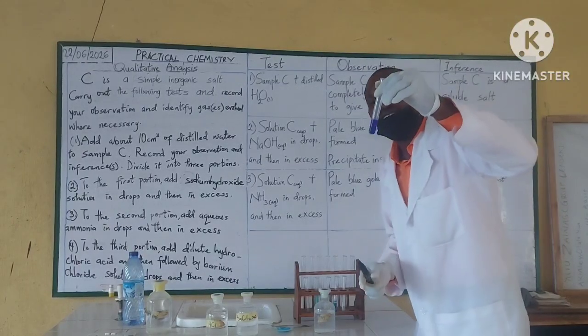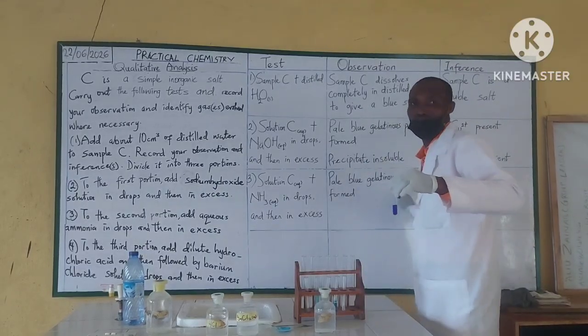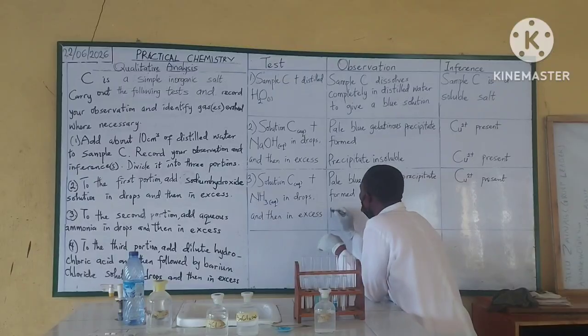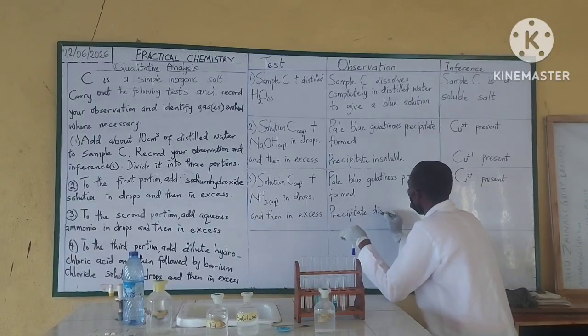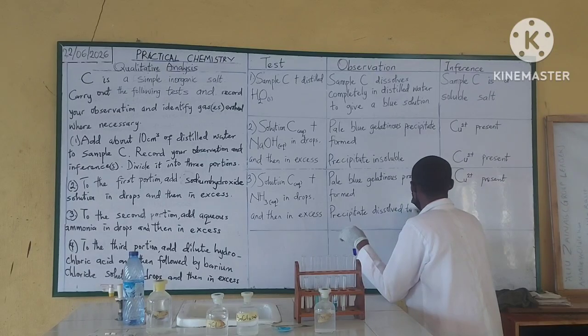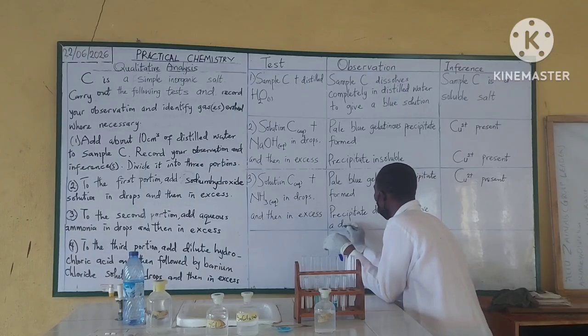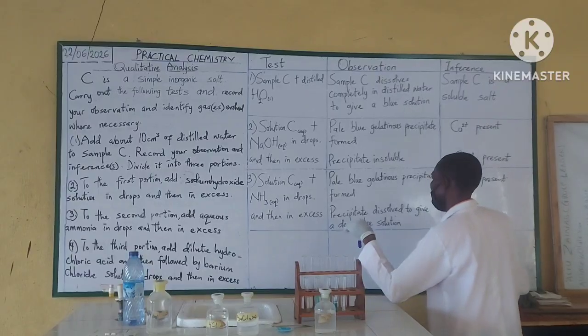We say precipitate dissolves to give a deep blue solution.